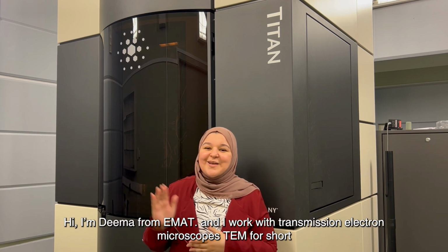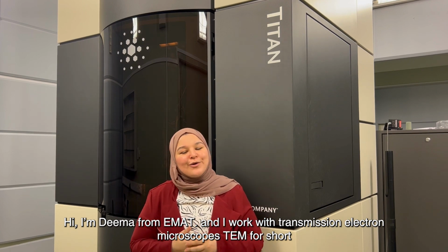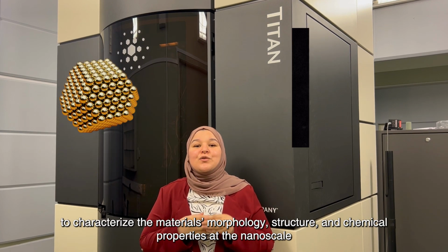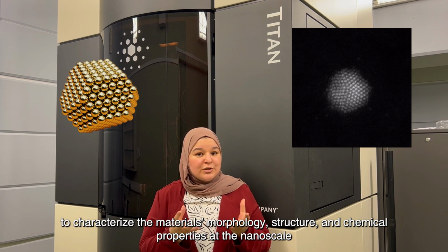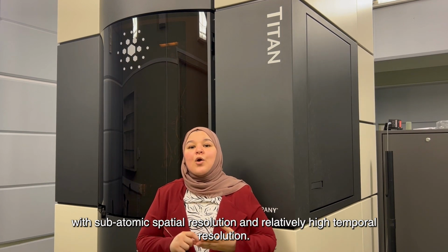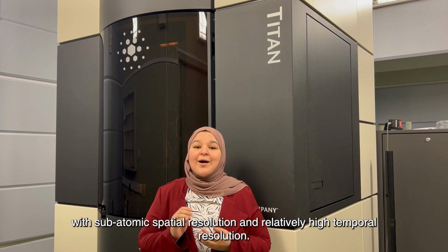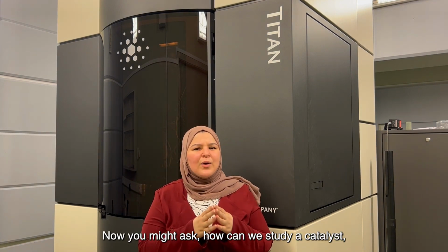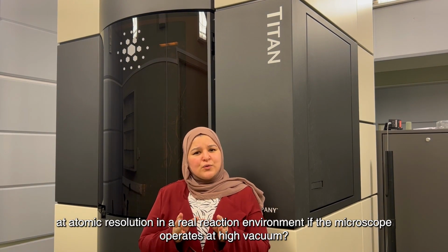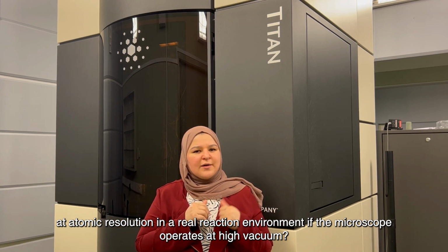Well, hi, I'm Dimma from EMAT, and I work with Transmission Electron Microscopes, TEM for short, to characterize the material's morphology, structure, and chemical properties at the nanoscale, with a subatomic spatial resolution and relatively high temporal resolution. Now, you might ask, how can we study a catalyst at the atomic resolution in a real reaction environment if the microscope operates at high vacuum?